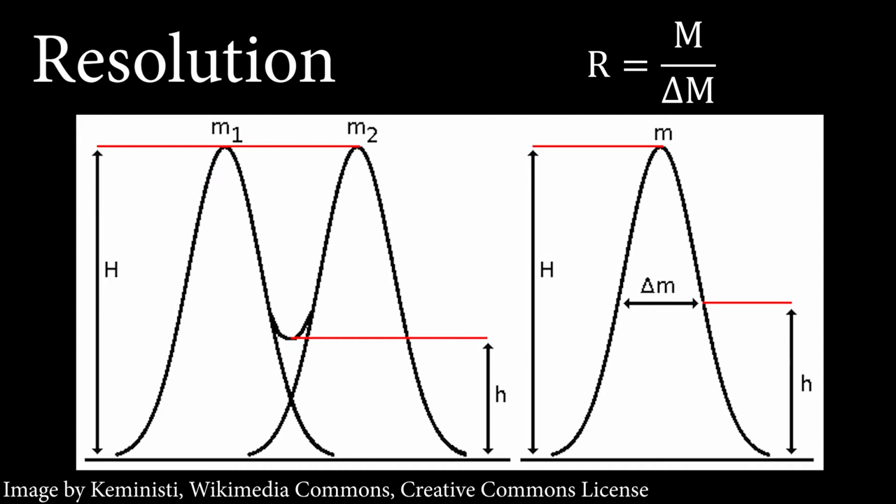Now, resolution is not the same definition as it was in chromatography, where it was always a relationship between two peaks. We don't need two peaks to do this. And we're not just going to say, okay, resolution 1.5, we've achieved resolution, we'll quit there. A lot of times you want as much resolution as you can get because it's going to give you exact mass measurements. Okay, but it's a relatively straightforward calculation.